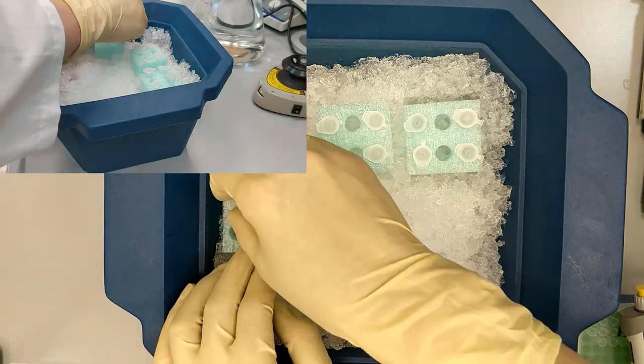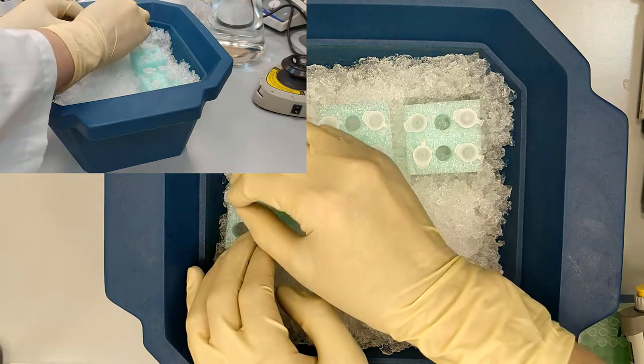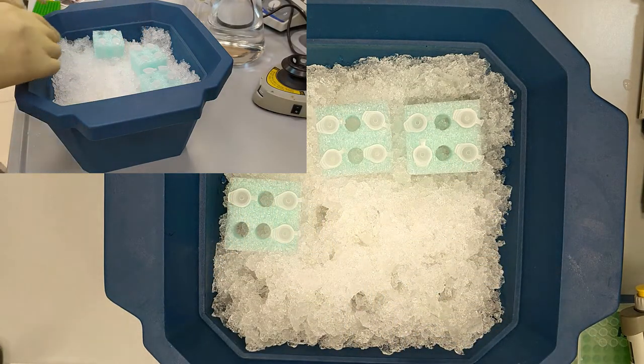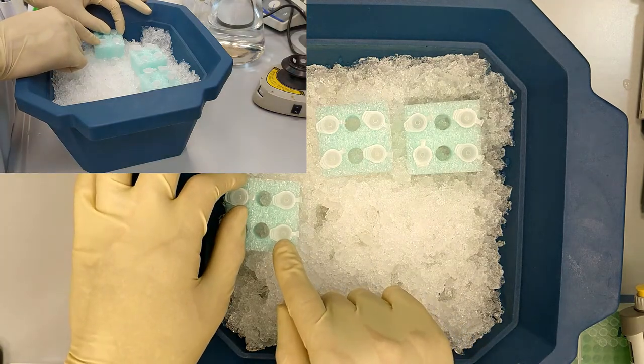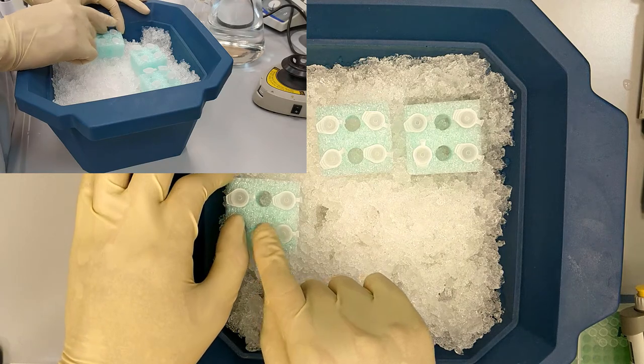After that, we will be incubating this mixture on 37 degree water bath. And we will be doing it to make sure that our restrictases start their job.